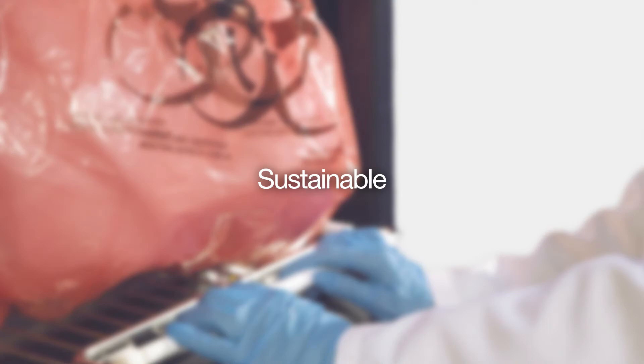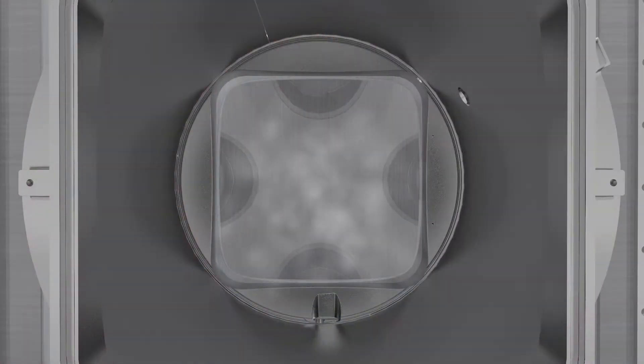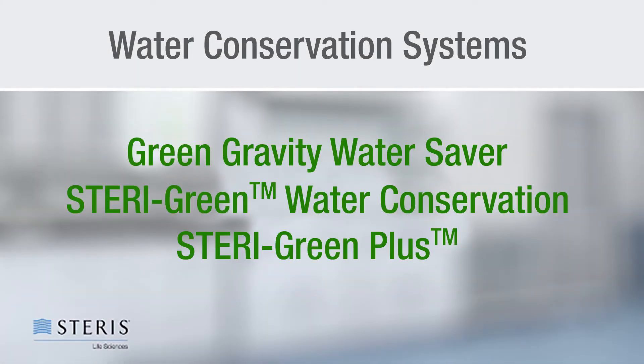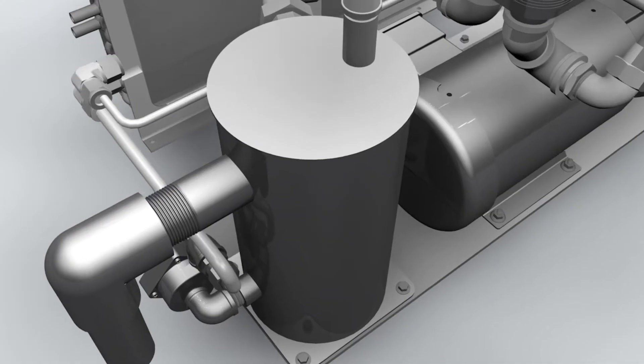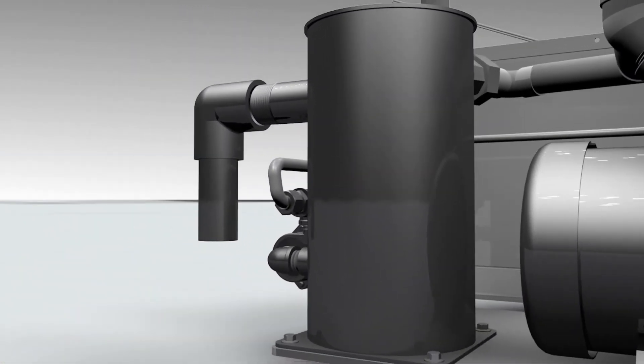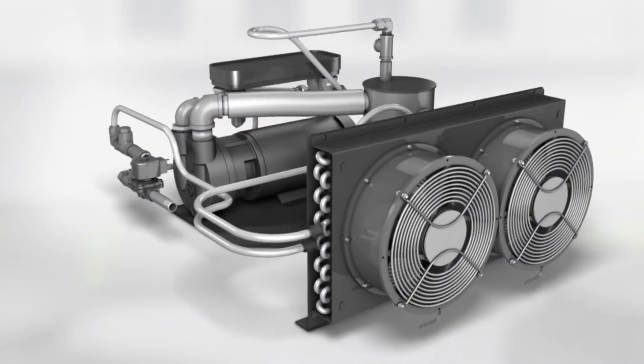Knowing the importance of being a sustainable lab, the AMSCO small LS series can be configured with one of three water conservation systems and is equipped with other energy saving features as well. The Green Gravity Water Saver is a great choice to save water used to cool steam effluent generated in gravity and liquid cycles.